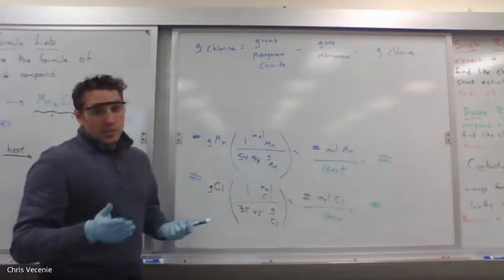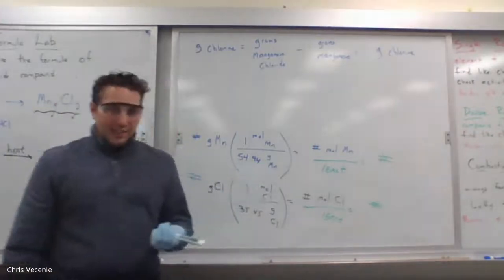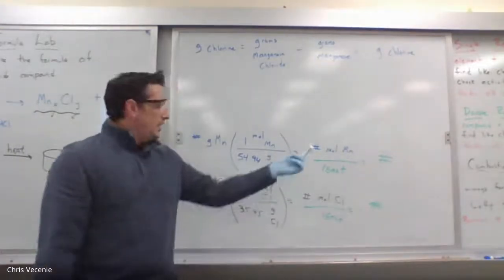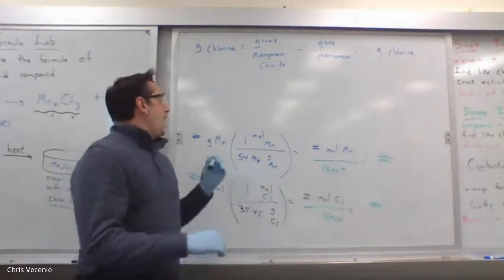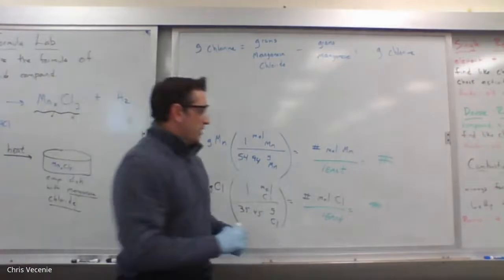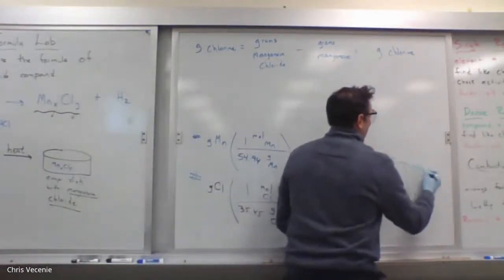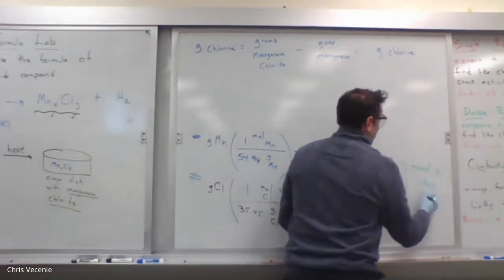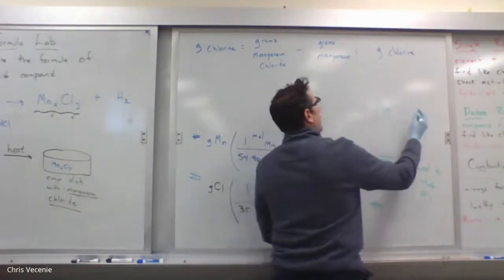All right. Here's a difference between an in-class problem and lab. In class, we would do the multiplier if it wasn't 0.0 something or 0.9 something. All right. In the lab, we will simply round them to the nearest number. So these guys here round to whole numbers and then use them in your formula.